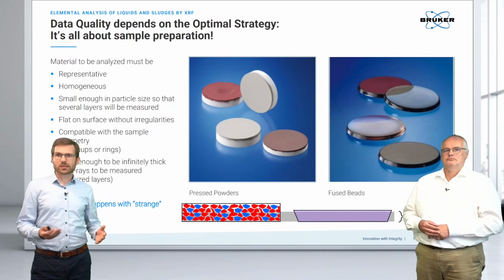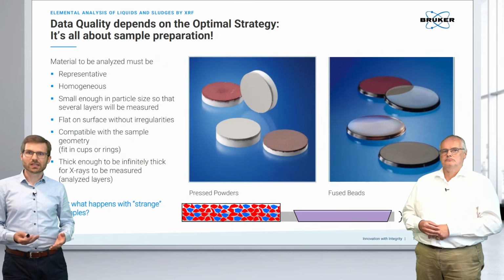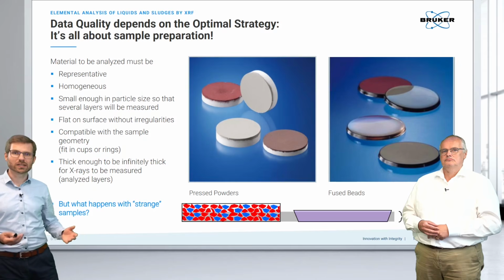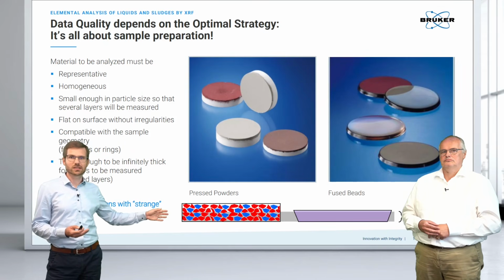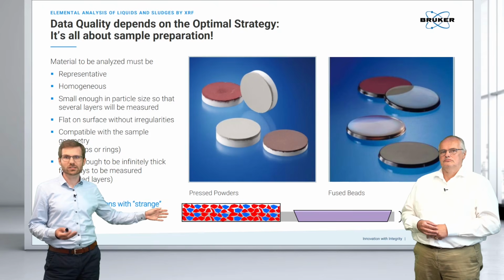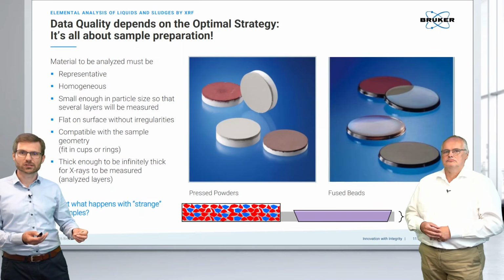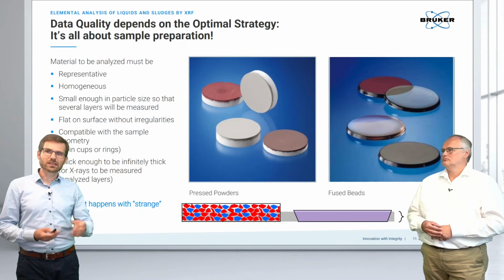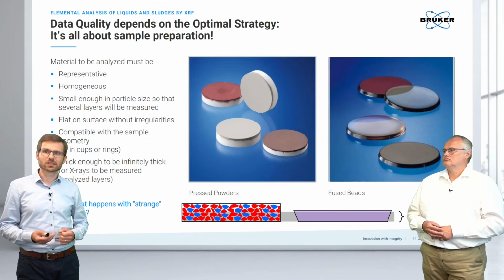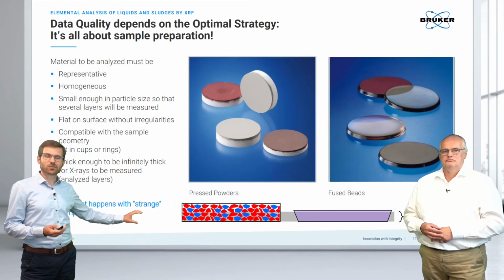We talked a bit about the preparation, and today is about more heterogeneous samples. And this is a little bit depicted here again. Some things I already mentioned, but just to show you again, here is an illustration, a sketch of a pressed pellet where you see grains of some materials and grains of other materials. As you can imagine, the coarser this is, the more likely it is that you don't get a representative signal from the sample. There's also just a certain information depth.